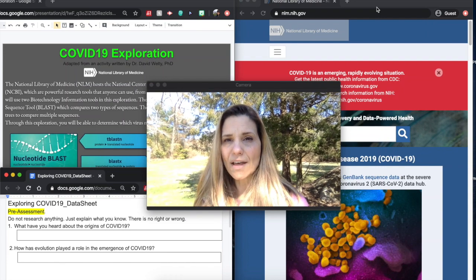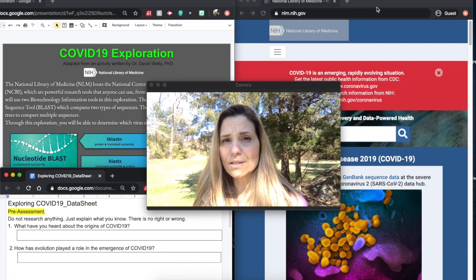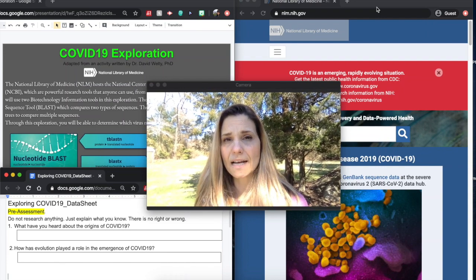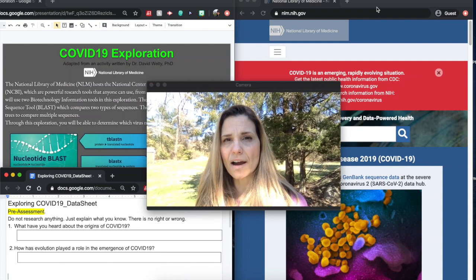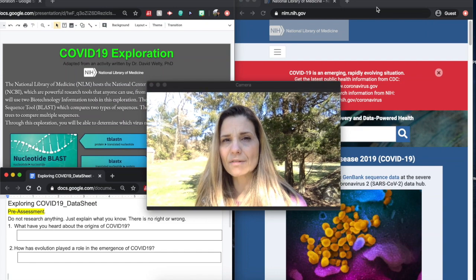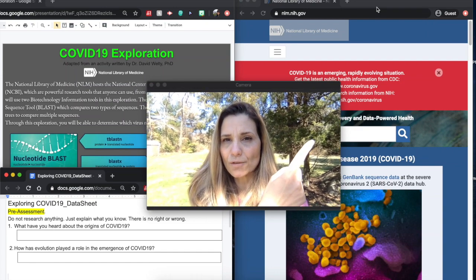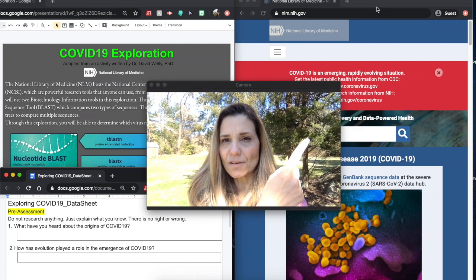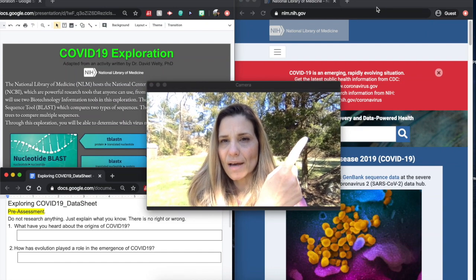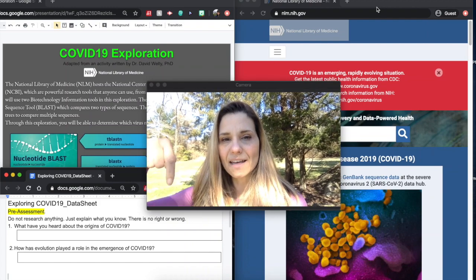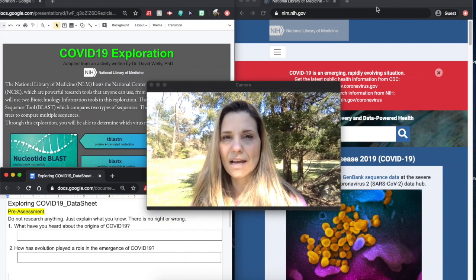The tool that's going to allow us to compare the nucleotide sequence of the virus with some other common viruses will be through this website here, the National Library of Medicine. We'll be collecting all the data in this Google Doc.